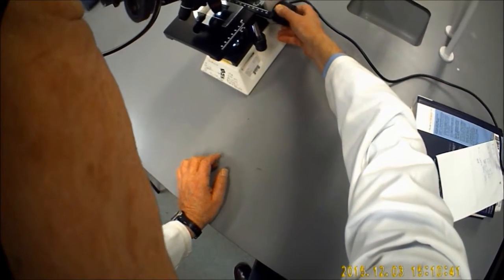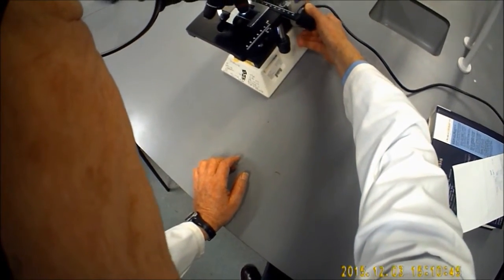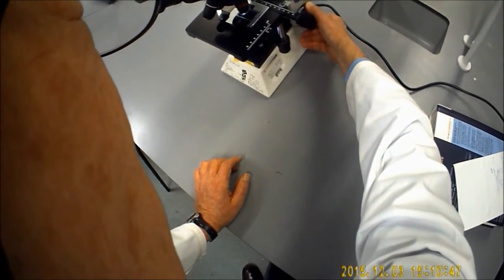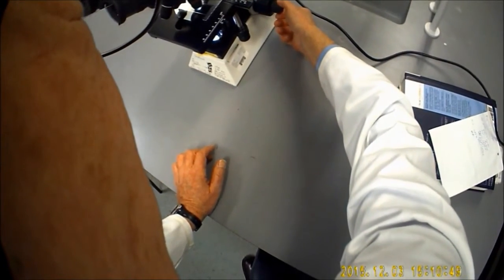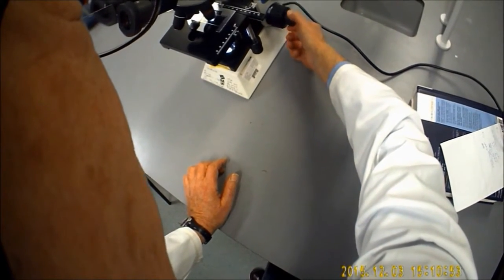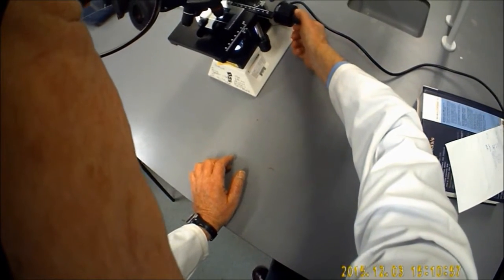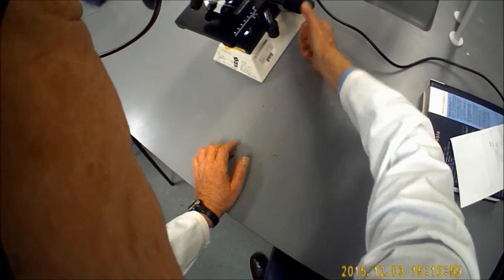This control is the normal focusing control, so you can get your subject into focus. At the end you've got a supplementary control, which is a fine-tuning, fine-focusing control. That enables you to sharpen up the image as much as possible.